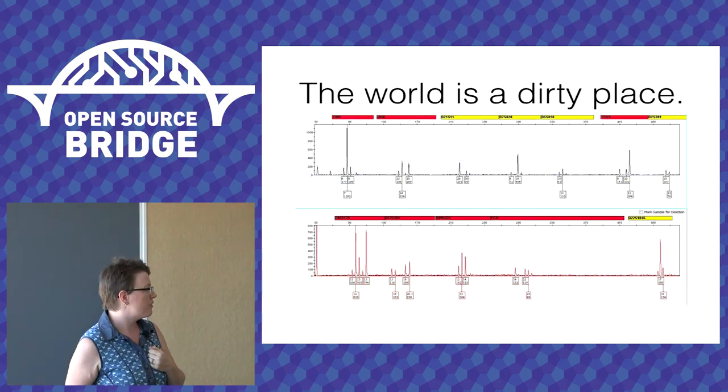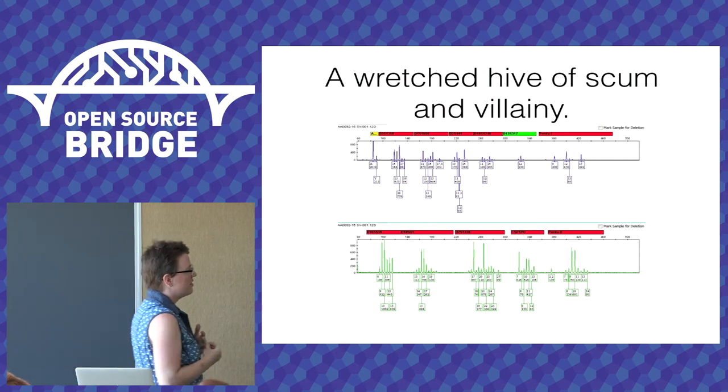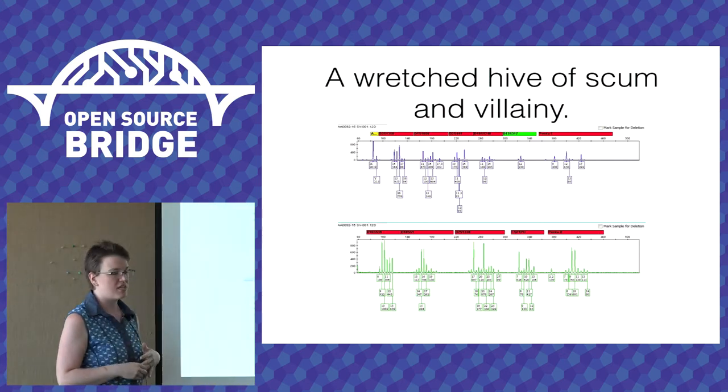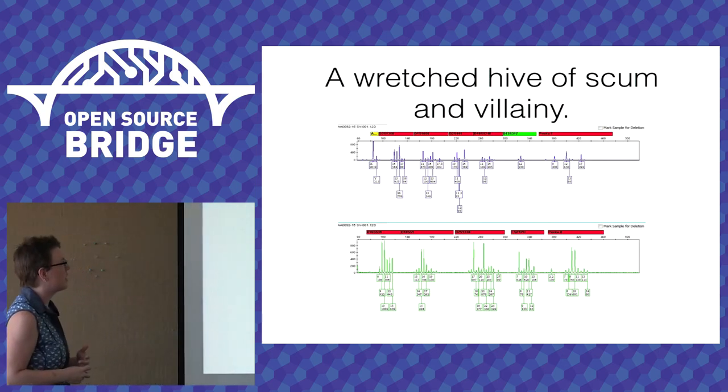This is the other half of the profile. Okay, but this is not bad. This is bad. This is a dirty profile. This is from a homicide that I'm testing. Well, I tested it last week, and the detective thinks I'm writing the report this week, but I'll actually write it on Monday.